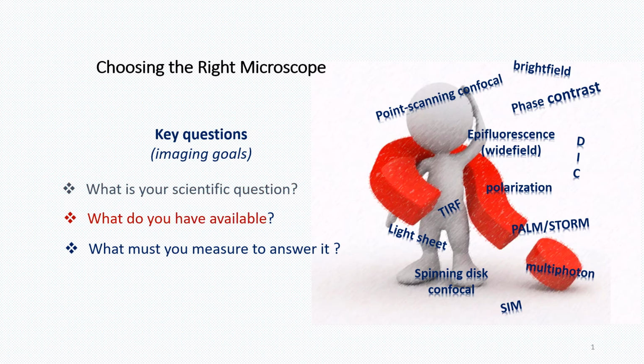The second issue is pragmatics. What do you have available? Do you have a microscope in your lab or a neighboring lab? Does a core facility offer the type of microscope that you need?